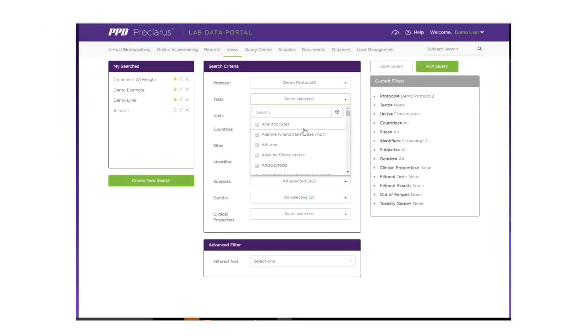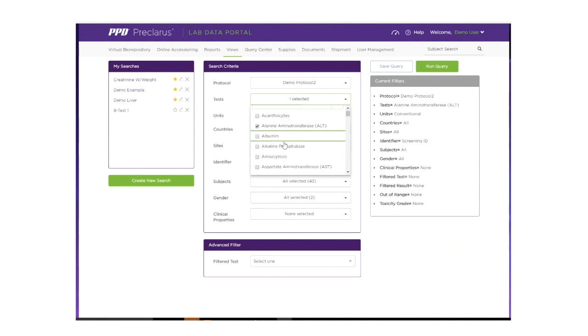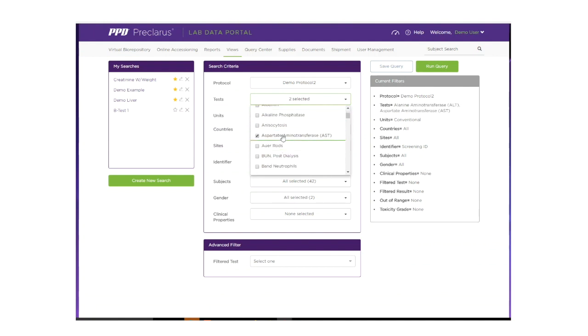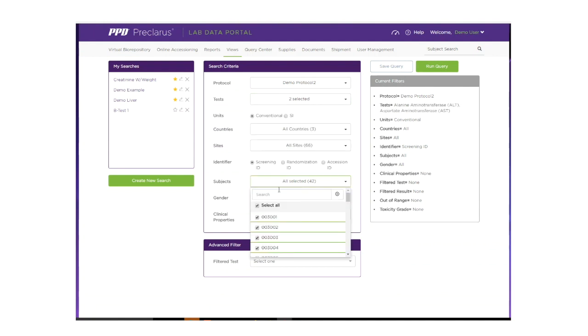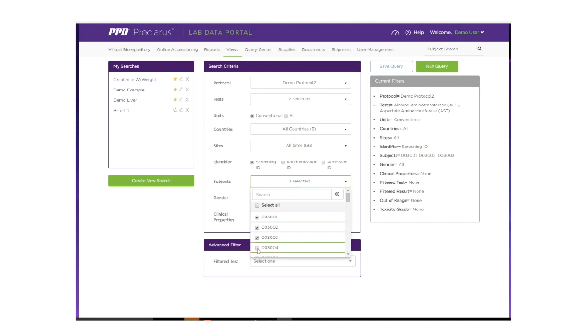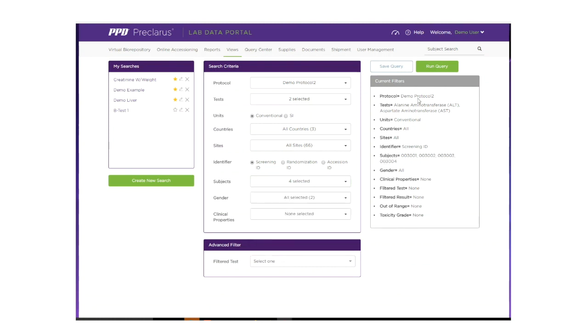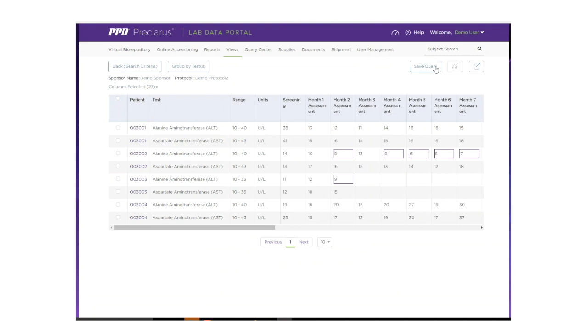In addition to access to data at the patient level, the Lab Data Portal provides consolidated views of data across subjects, time points, sites, and other dimensions as you define them.